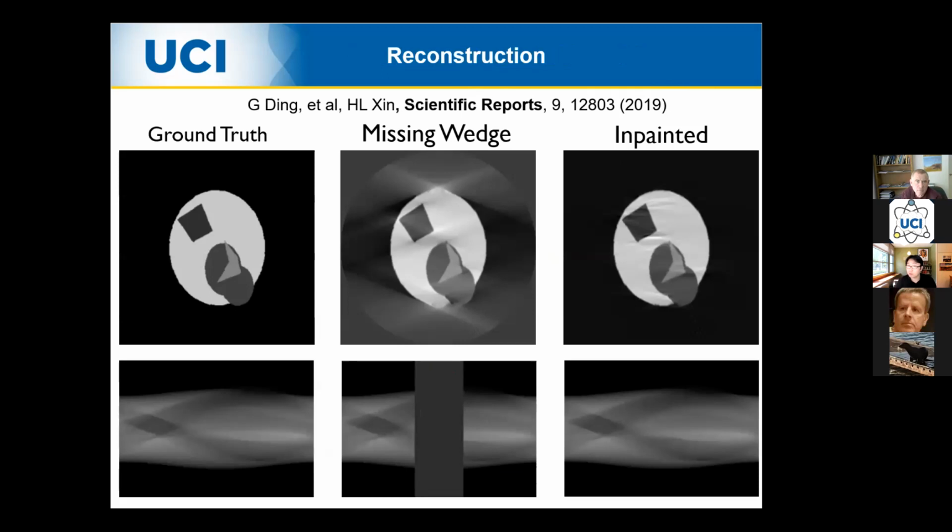However, we need to put it in a real test, which is the reconstruction. And here you find there are still some ghost artifacts, right? You have these streaks here, you have this arc here, right? It's not very satisfactory, right? So when I first saw this, I was like, I don't like it. Kind of a failure, right?